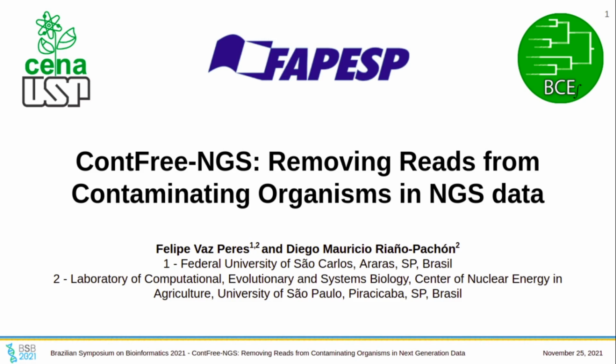I am an undergraduate student in biotechnology, and today I'm going to talk about ContFree-NGS, a simple software that enables the user to remove contaminated sequences from their next generation sequencing dataset.